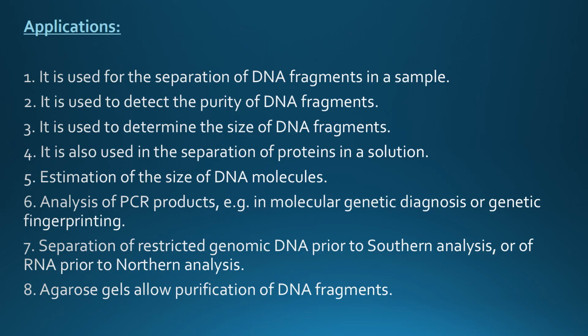Applications. It is used for the separation of DNA fragments in a sample. It is used to detect the purity of DNA fragments. It is used to determine the size of DNA fragments. It is also used in the separation of proteins in a solution.